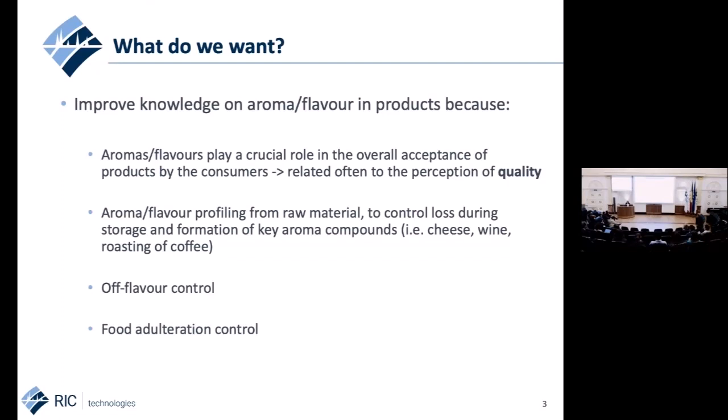So when it comes to aroma and flavor analysis, why is it so important? Well, it is important because through analysis of aroma and flavor, we get to know our products better. And generally, we tend to believe that products which smell and taste good are of better quality than products which do not smell that well. Additionally, for food and beverage producers, it's very important to determine the aroma profiles of their products, of the raw material, and to check the aroma profile during storage. Is there any loss of aroma during storage or not?